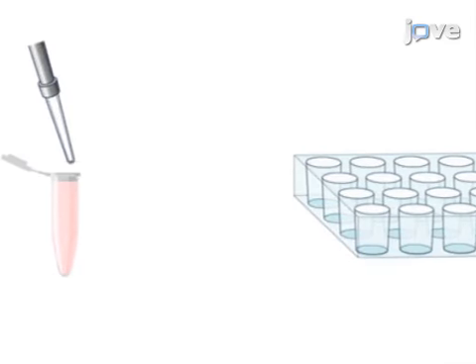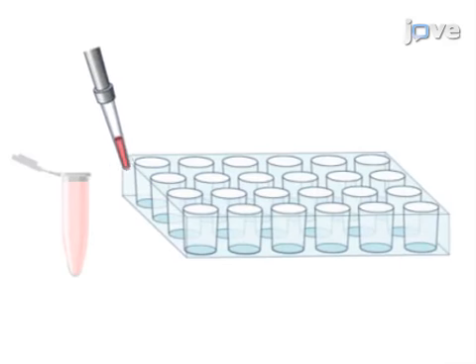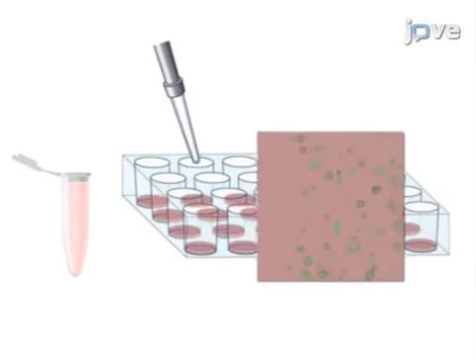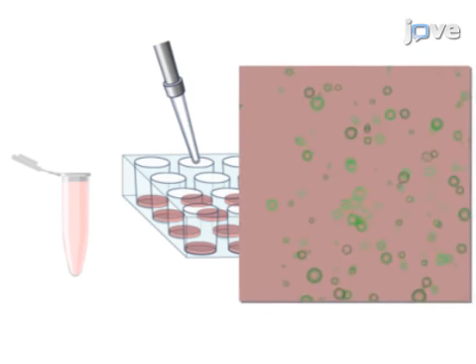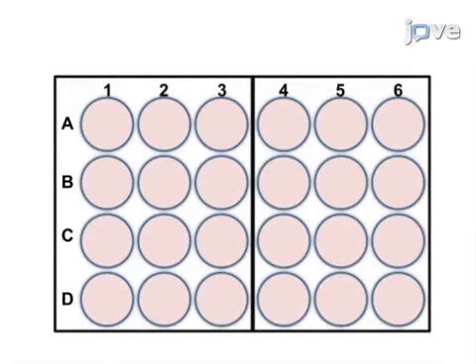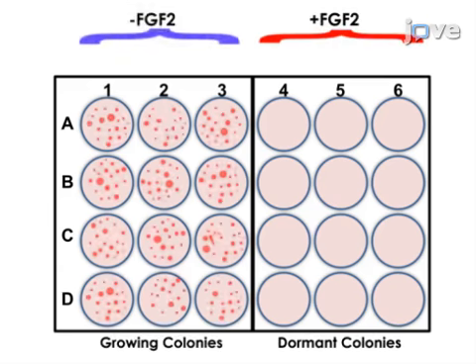This is achieved by culturing estrogen-positive breast cancer cells in fibronectin-coated tissue culture plates at clonogenic density, where their interactions are primarily with the substratum and not each other. As a second step, a dormant state is activated in some of the estrogen-positive cells, supported and maintained by FGF2 and fibronectin, representative of breast cancer cells in the bone marrow.